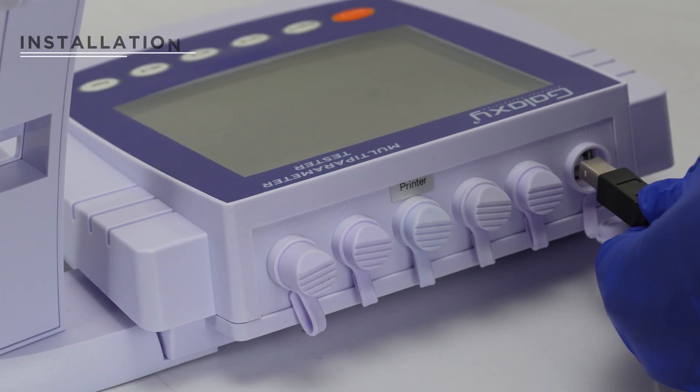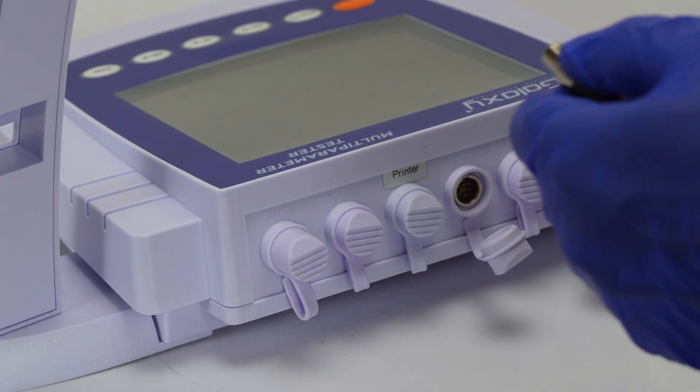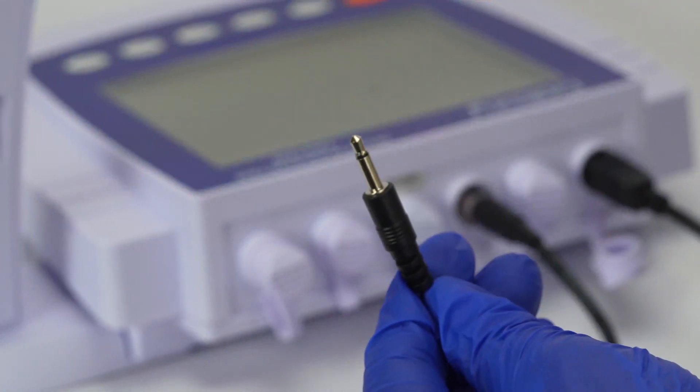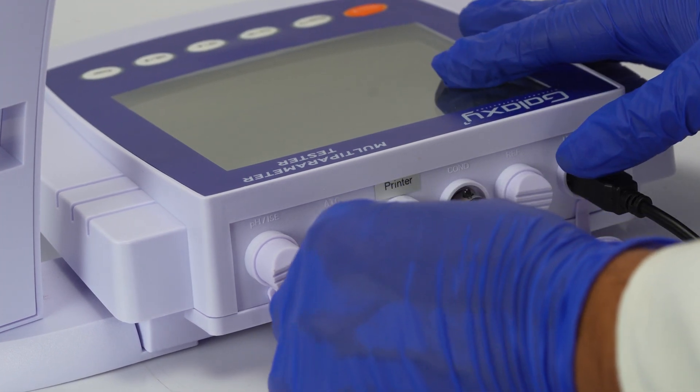Connect the power adapter to the meter and insert the conductivity electrode's six-pin connector into the socket labeled CON. Insert the temperature probe into the socket labeled degrees Celsius.